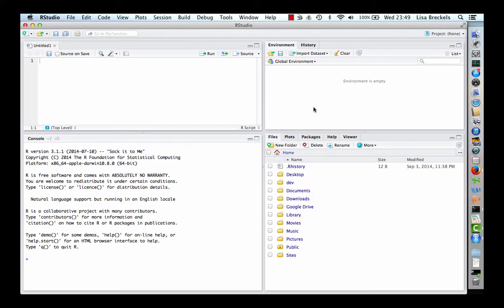In addition to ProLock GUI, we will also install the related bioconductor packages ProLock and ProLock data. ProLock is a framework for spatial proteomics analysis and ProLock data is a data package containing quantitative proteomics datasets which we will use later on to load and visualise with the ProLock GUI.